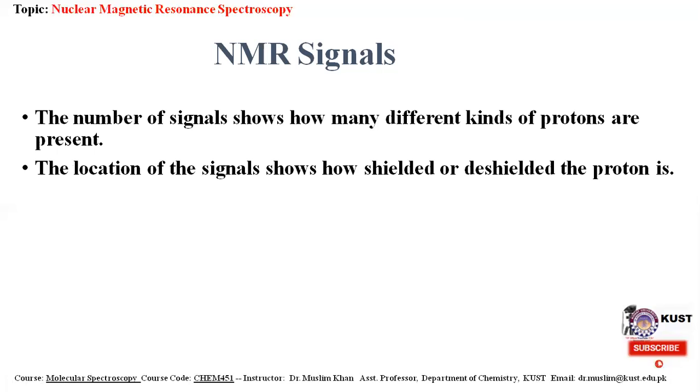The location of the signal shows how shielded or deshielded the proton is.